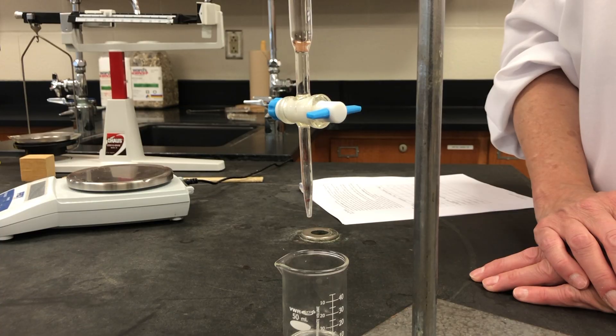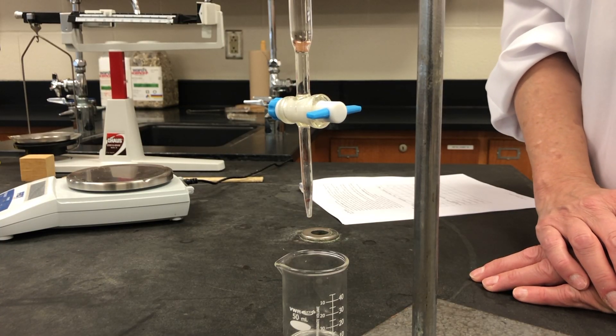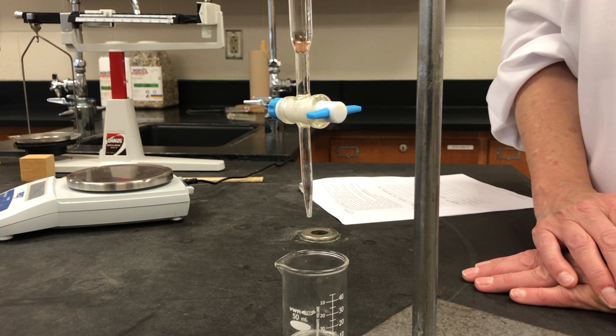Next we tare our electronic scale. We place a 50 milliliter beaker on the scale to determine its mass. Record the mass of the beaker in grams in your data tables.